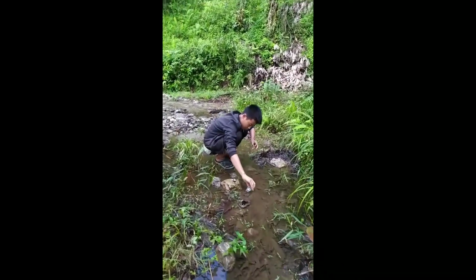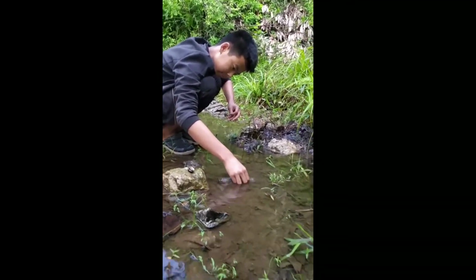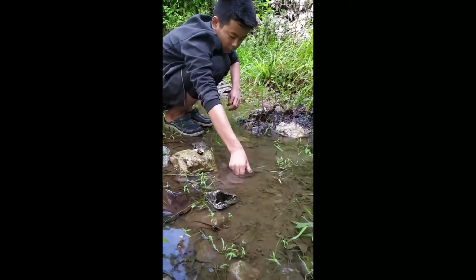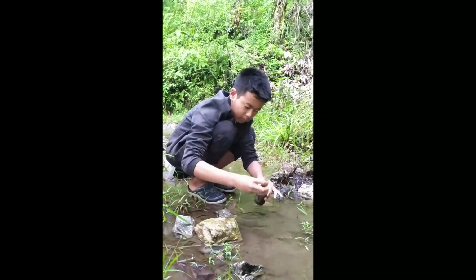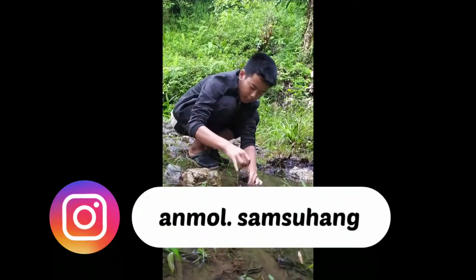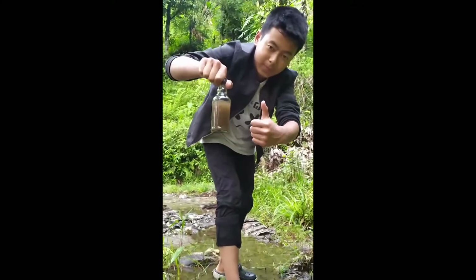I have brought a glass bottle with me and I'm taking the very low part of this puddle water, the part which contains the mud and the sand also. If I take the above clear water, the chances of getting organisms are low in number. So it's done. Let's get back home. So I'm going to show you what we can find in it.